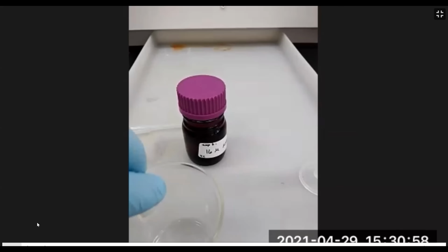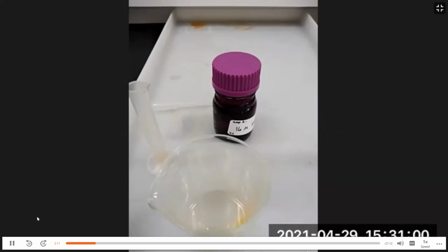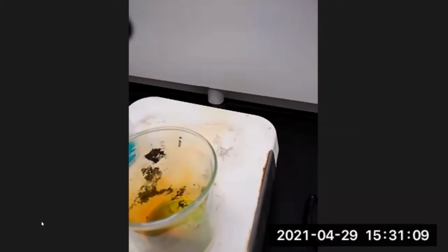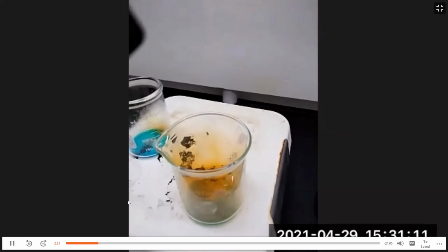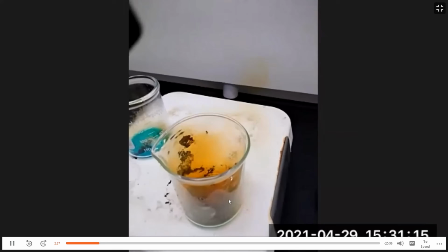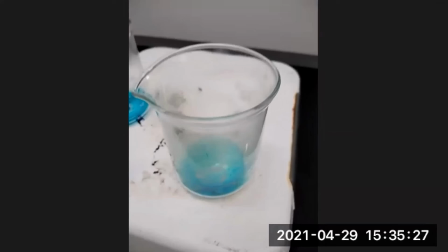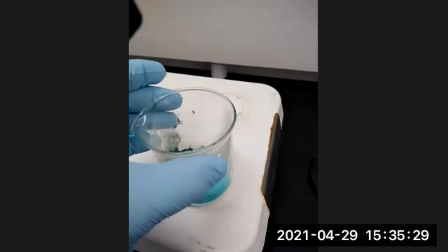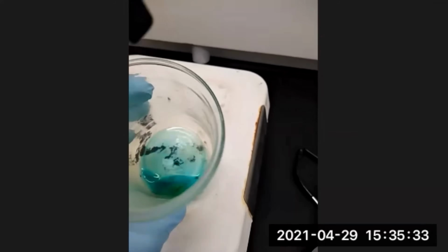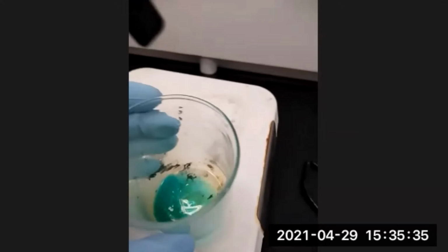So we're here in the hood. There's our 16 molar concentrated acid. We need to measure, I think it's 5 milliliters of the concentrated nitric acid. And as you can see, we're already seeing the reaction occur. The solution is turning a creepy green color. We have nitrogen dioxide being released from the reaction. And over time, you see the reaction goes to a blue solution, indicating the presence of copper 2 ions.